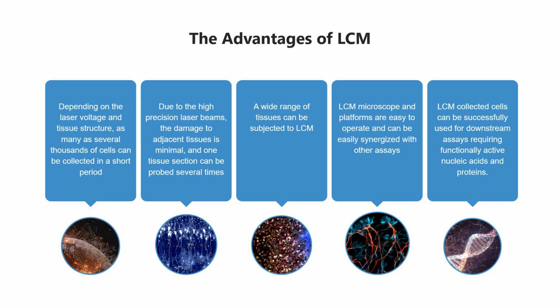4. A wide range of tissues can be subjected to LCM including regular hematoxylin and eosin stained slides, archival sections and immune-stained frozen/fresh tissues among others. 5. The lasers used are essentially low-powered and therefore do not destroy the structure and integrity of macromolecules.